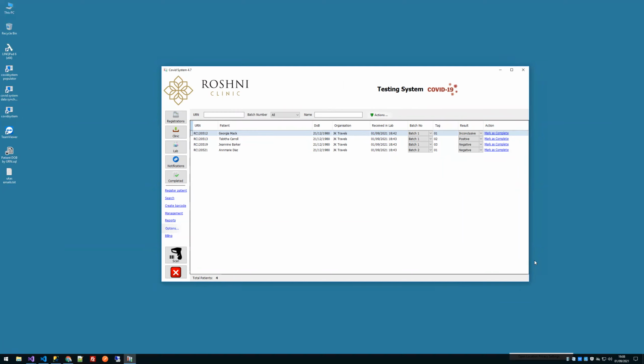Although when stuff comes in from the day 2, day 8 tests, when people are registering from different countries, that can still come in. So it does run throughout the night.